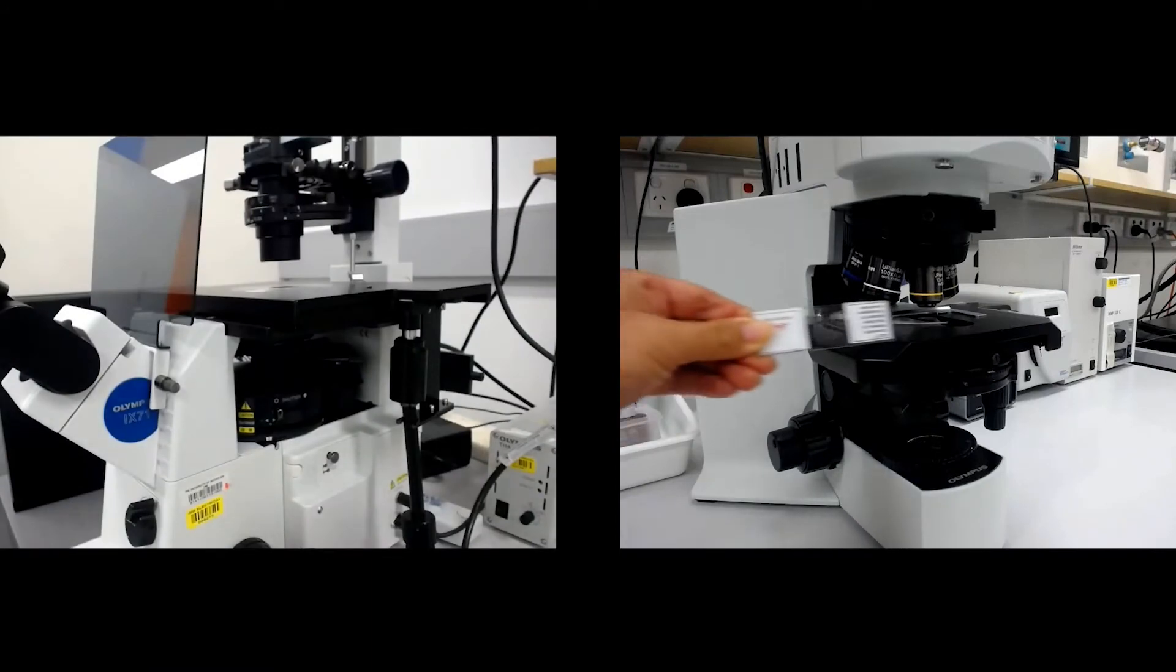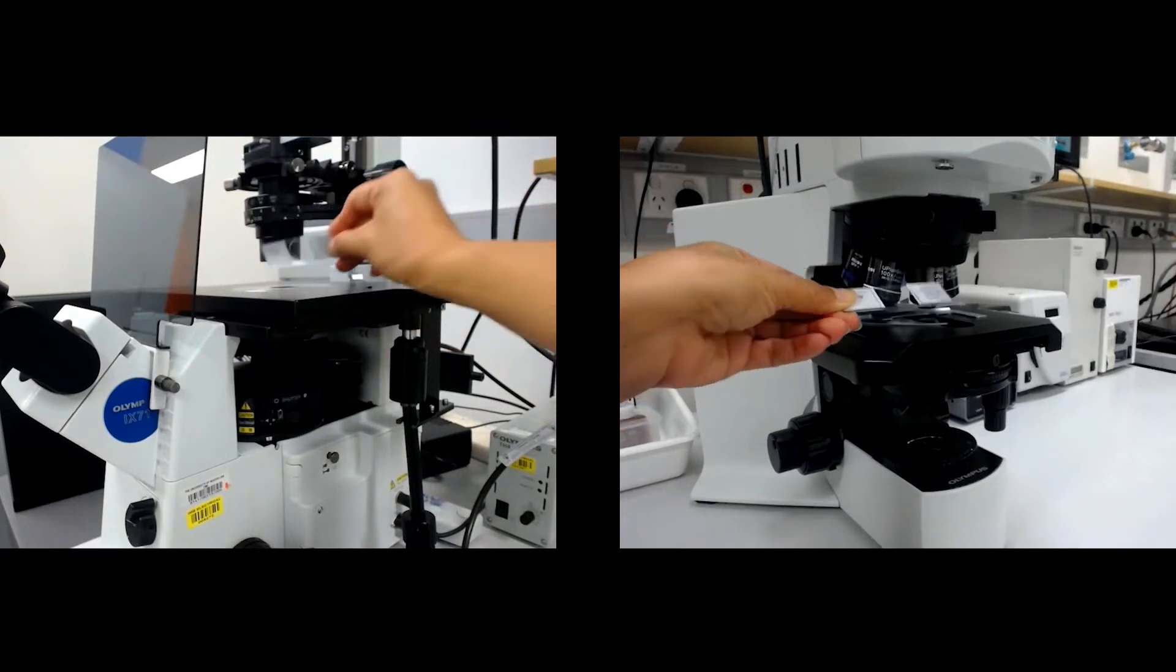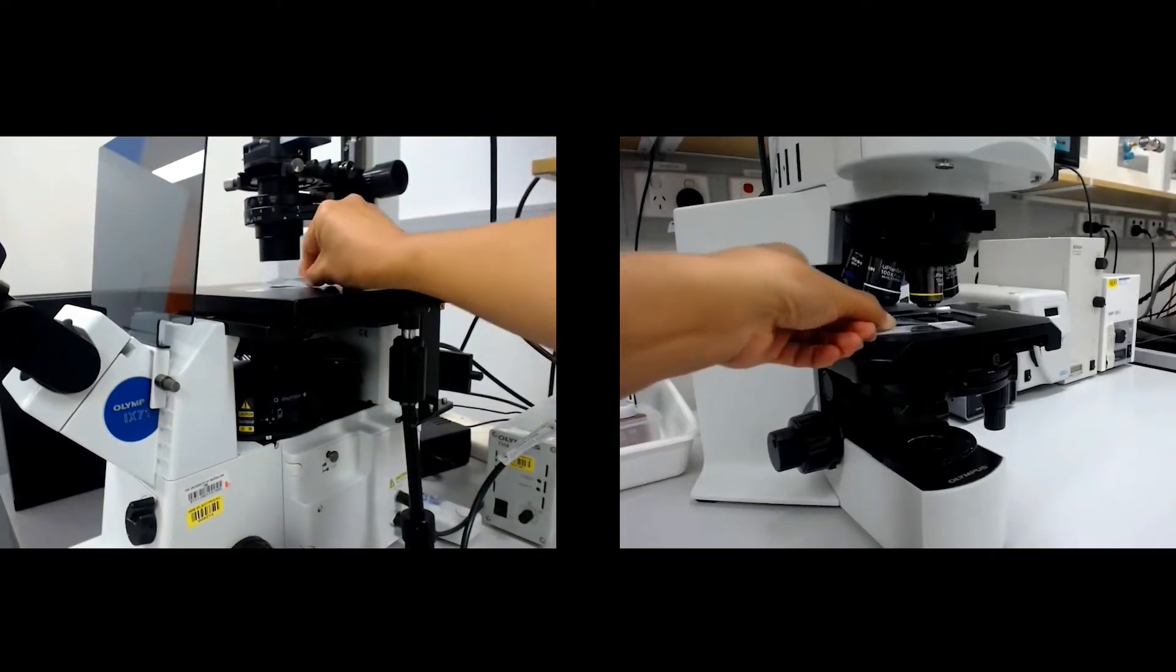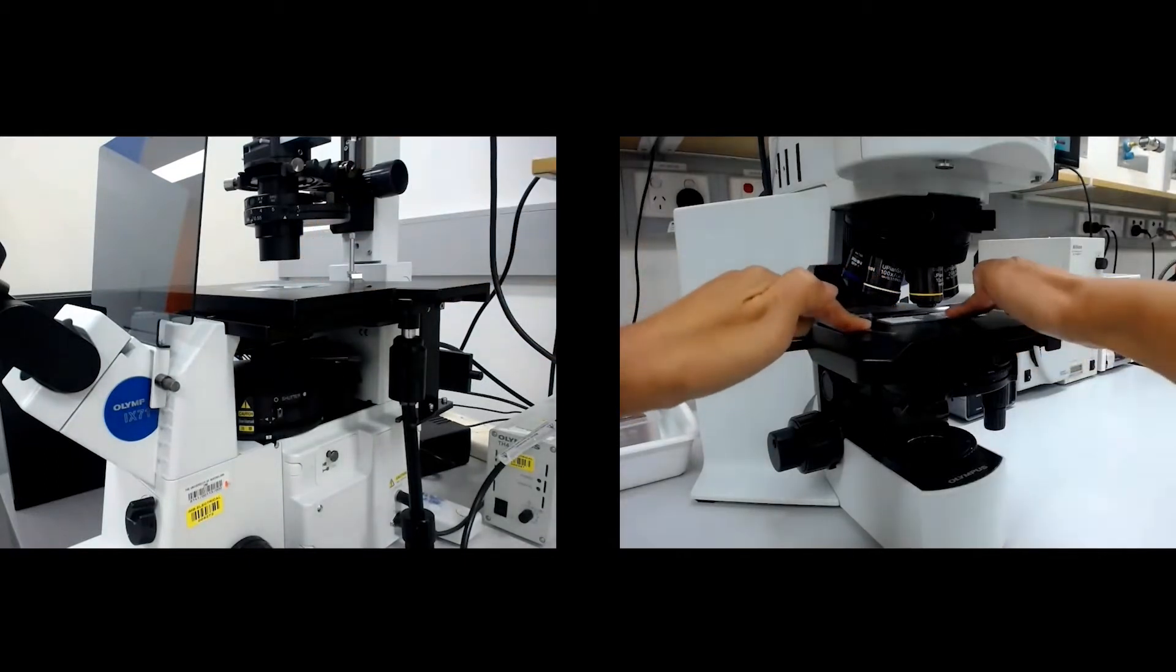Place the specimen on the stage, ensuring the cover slip points towards the objective. So on an upright microscope, the cover slip points up, and on an inverted microscope, the cover slip points down.